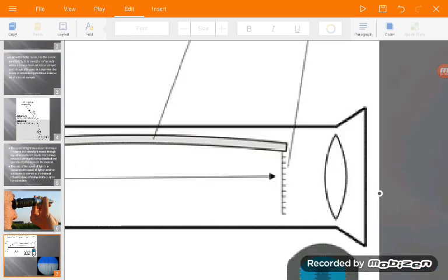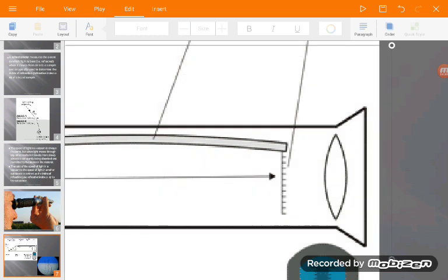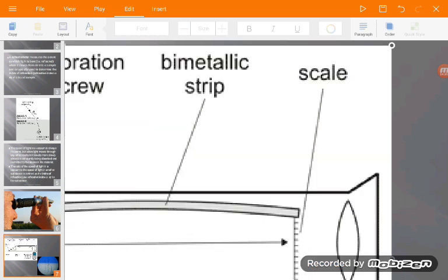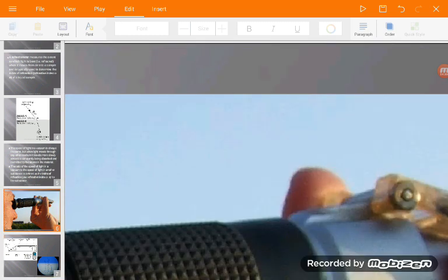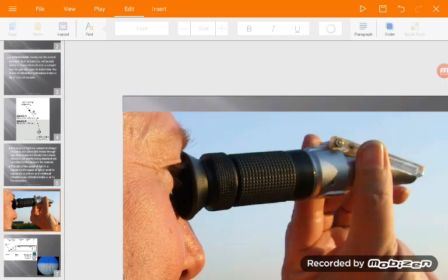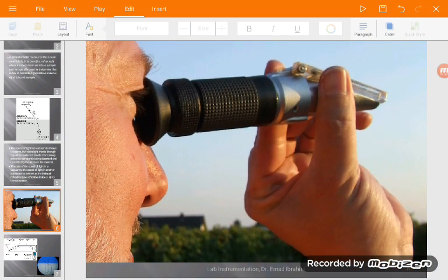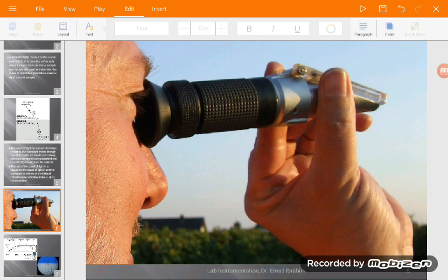This is the meter. As we can see, this is the meter scale, and we can read the refractive index of the sample. This is the refractometer. The upper area is where you open and place the sample, and you can see the scale here.